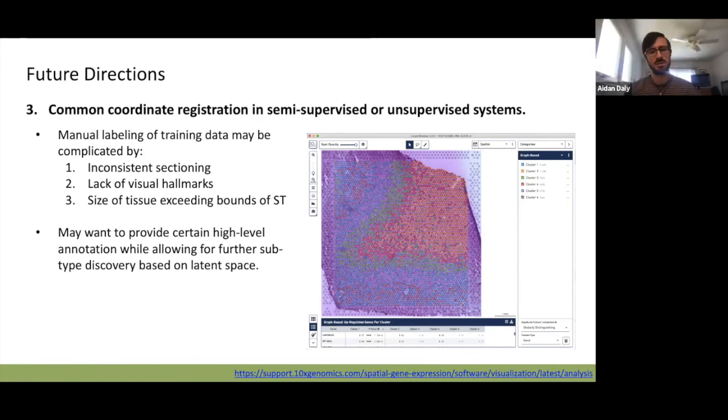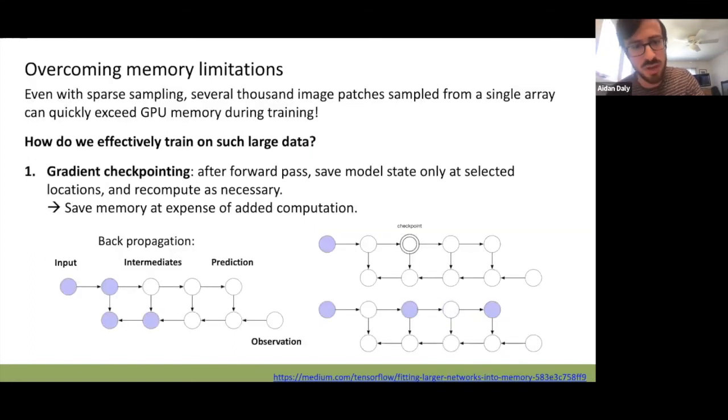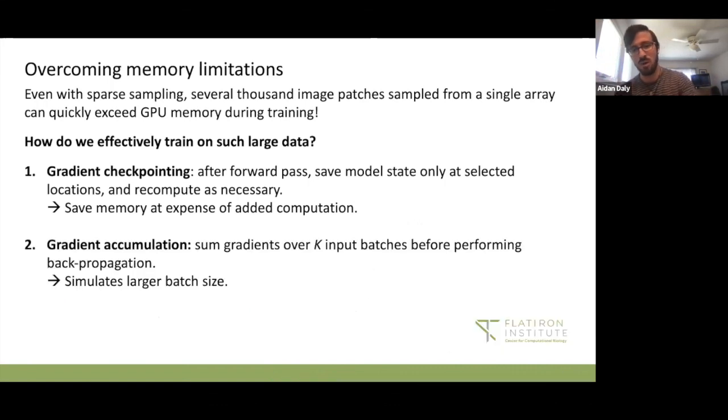So there are basically two ways to conserve memory in GridNet. One is by choosing your batch size, in the sense of how many arrays it looks at a time. Generally that will be one array at a time, and you can simulate larger batches by doing gradient accumulation.